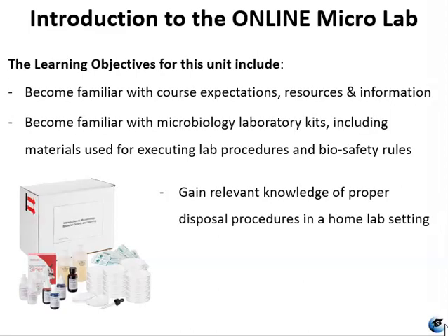The learning objectives for this specific presentation and unit include becoming familiar with course expectations, resources, and information. Students will become familiar with the provided lab kits, including materials used for executing lab procedures, and we will discuss proper biosafety rules and disposal procedures. That is, you'll be briefed on how to properly dispose of used specimen plates and slides in a home lab setting that is safe and up to OSHA and environmental codes.